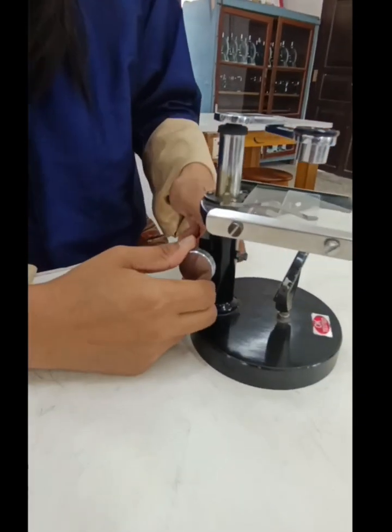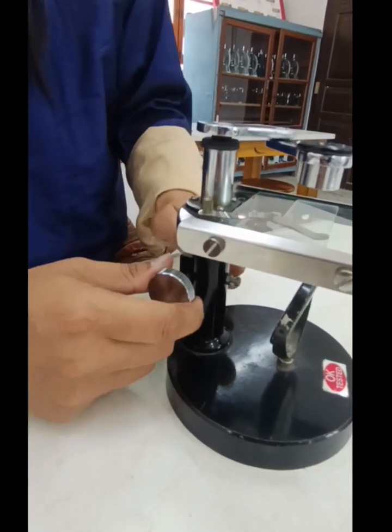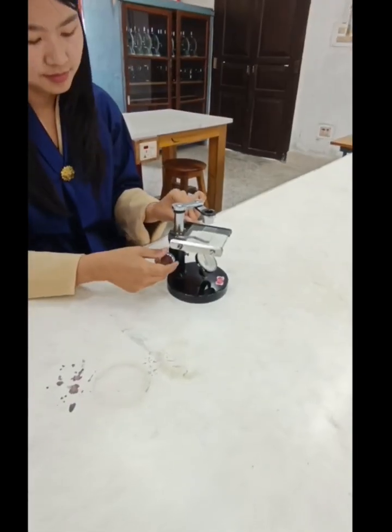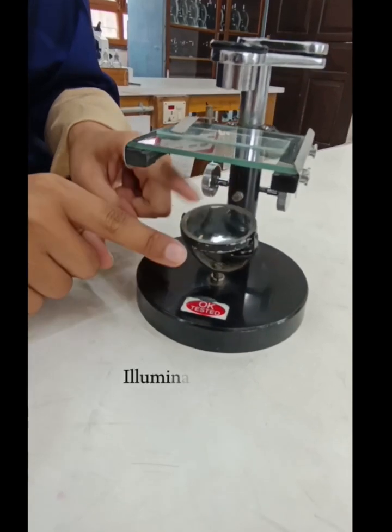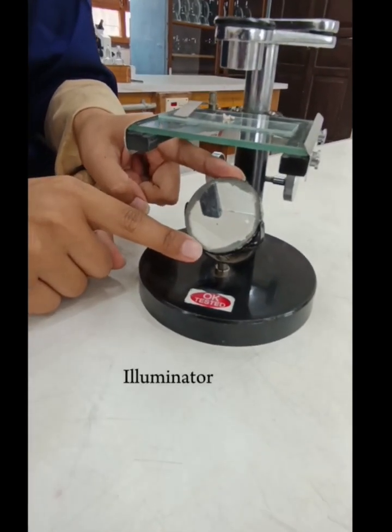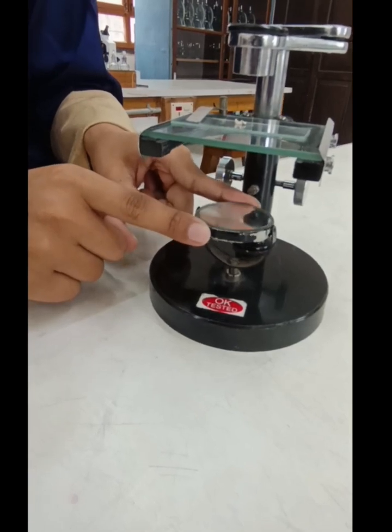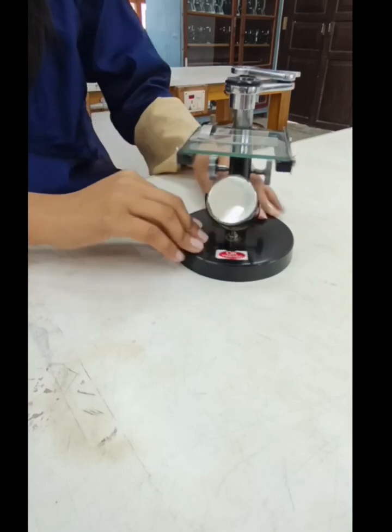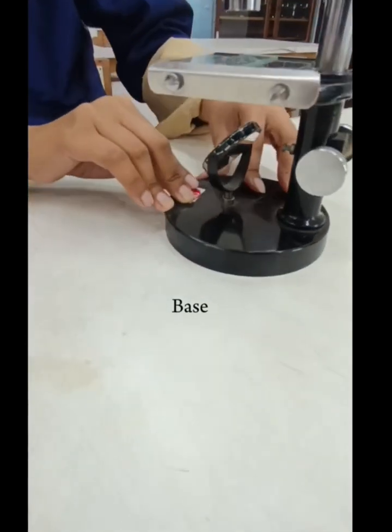And this is the adjusting knob. It helps to focus the specimen. This is the illuminator and it has two types of mirror, plane mirror and concave mirror. It helps to illuminate the light to the specimen. The last one is the base. It supports the whole microscope.